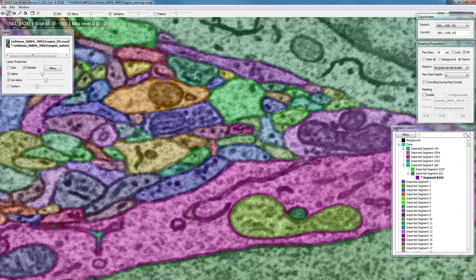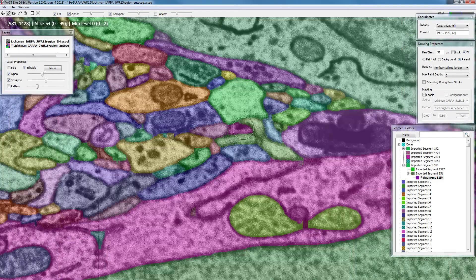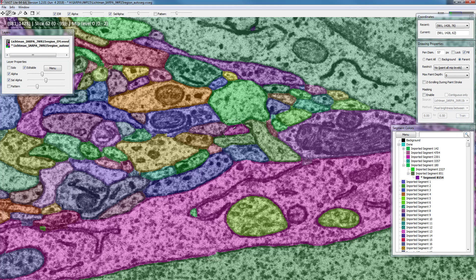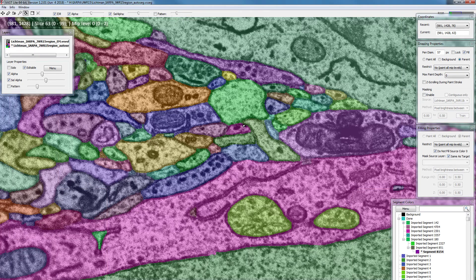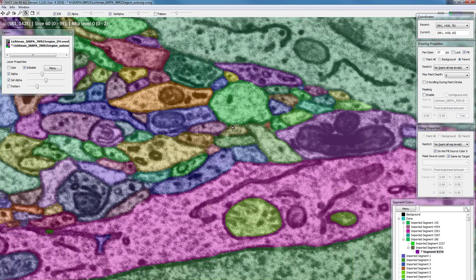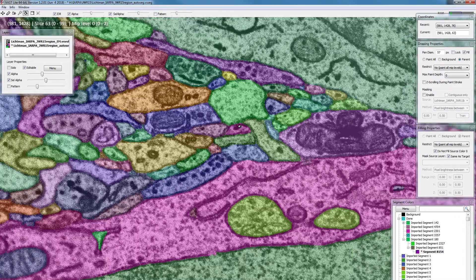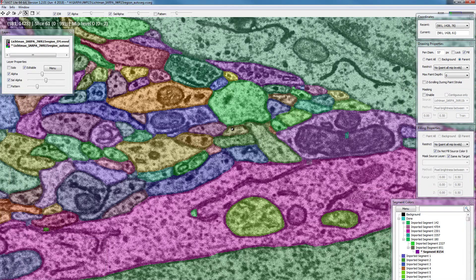You can still overpaint the whole thing like this but that's a lot of work, so you can also use filling. I'm going to select the fill mode here. In the standard way it is set up to fill in the same layer. What I want to do is take this new color and fill everything that's connected in the old color with the new color. Here this is the previous segment and then this is the segment I want to fill it with. If I just click once here, you can see it all became purple.